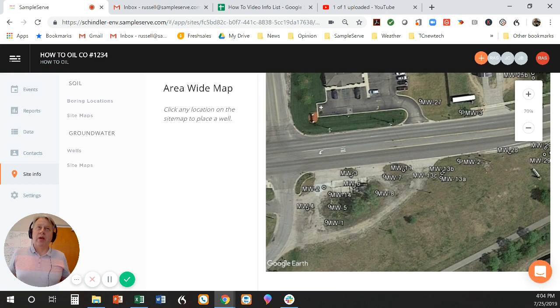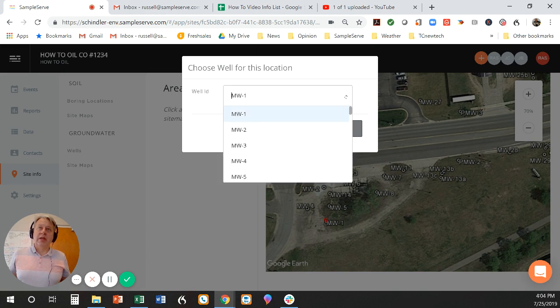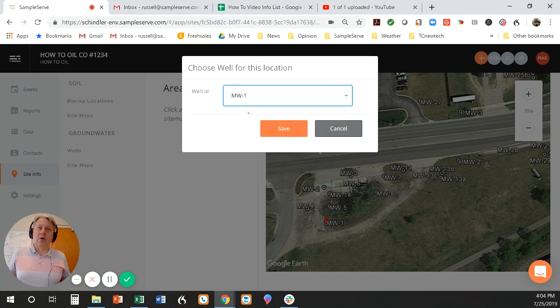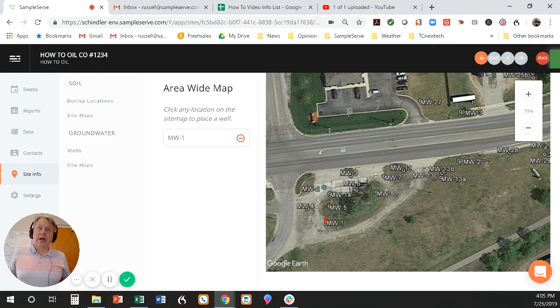When I want to locate a well — let's say monitoring well number one — I'm going to cursor over number one. It's going to put a location. I can then pull down. These are going to be listed in alphanumeric order, that's why I selected one first. I can just click one, hit save, and it's going to permanently recognize that location as number one.